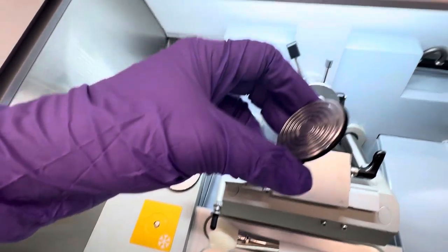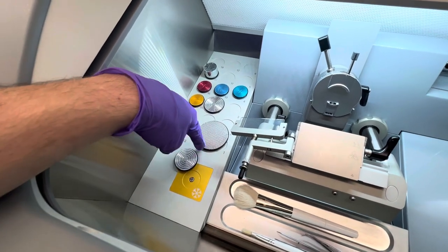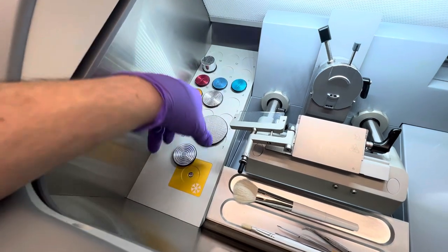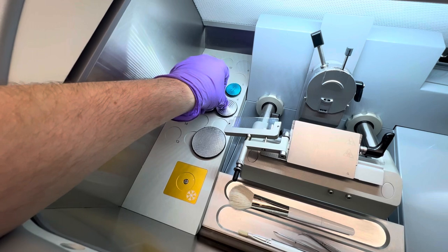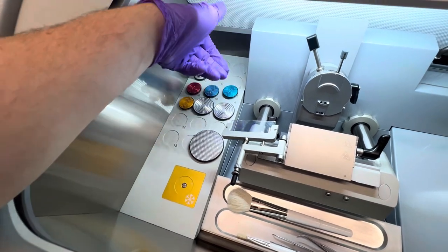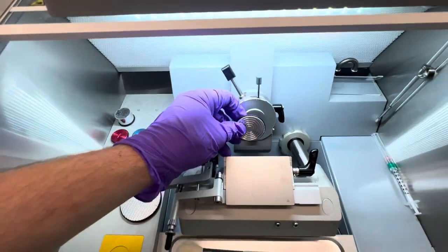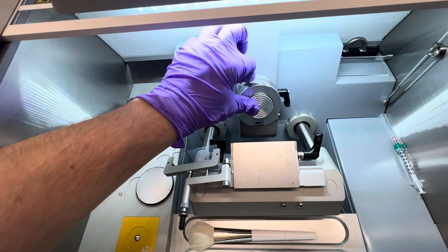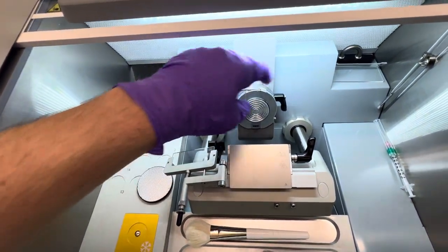If it doesn't seem well secured, once the block is frozen to it you can go around and put some extra OCT around the edges, and that's, again, pictured in the protocol. This little storage area is where you can place the chucks when you're not using them, like I mentioned in the protocol. Otherwise, once it's on the chuck, it will fit right into here in the specimen head. You can clamp it down like that, and it'll stay in place. You want to make sure this is nice and secure.